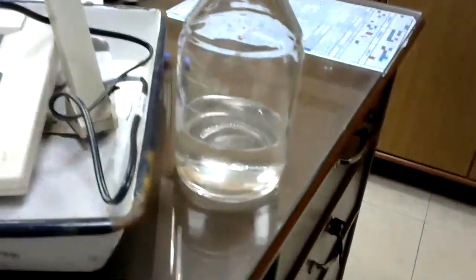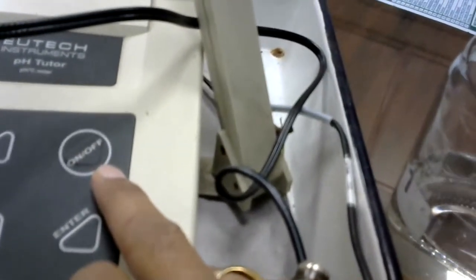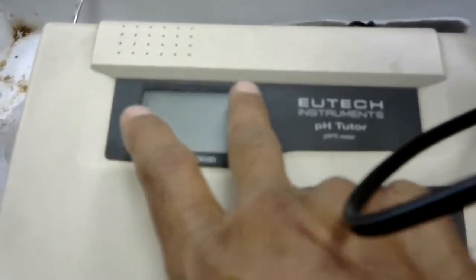It will be dipping, and then you have to switch on the pH meter. You can see the on/off switch is there, and this measure button is there. So if you press this button, it will take the pH reading, and on this display you will find what the pH value of this solution is. So to measure pH very accurately, you can use a pH meter.